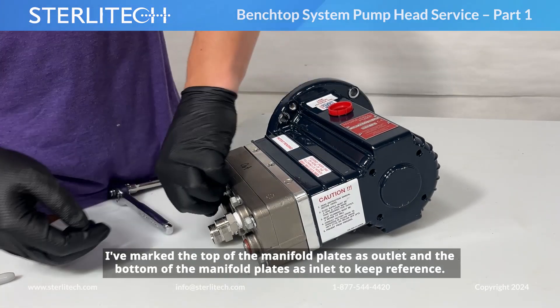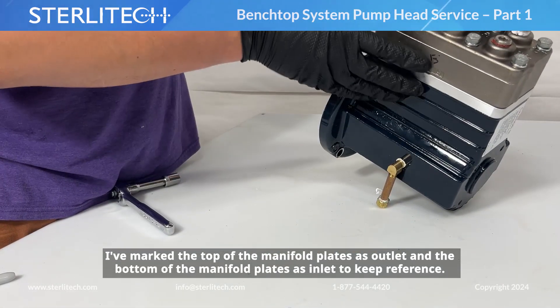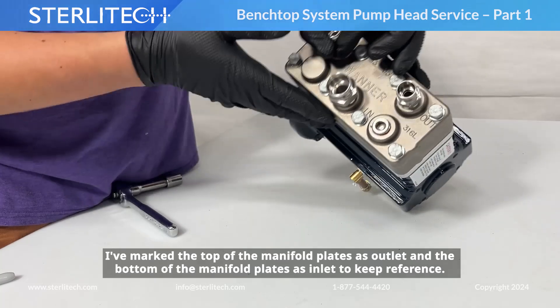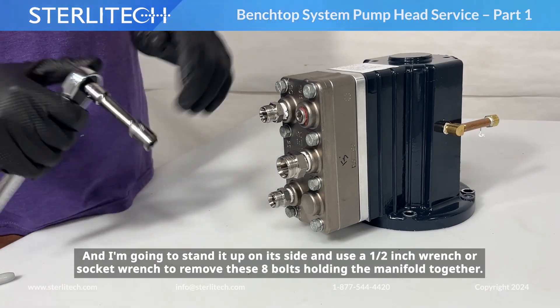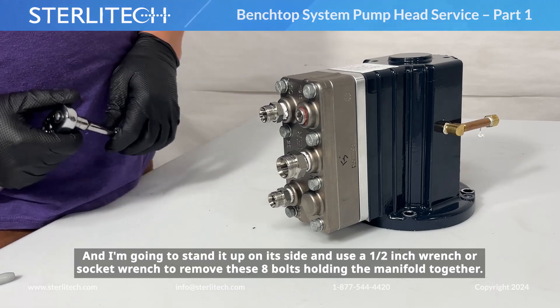Next, I've marked the top of my manifold plates as outlet, and the bottom of the manifold plates as inlet to keep reference. I'm going to stand it up on its side and use a 1/2-inch wrench or socket wrench to remove these eight bolts holding the manifold together.